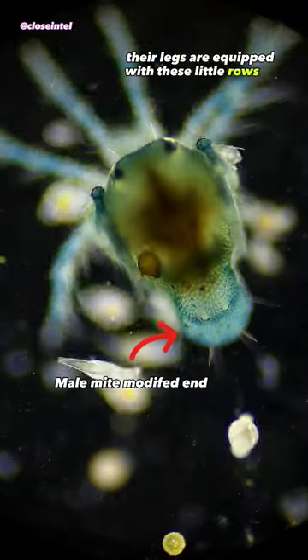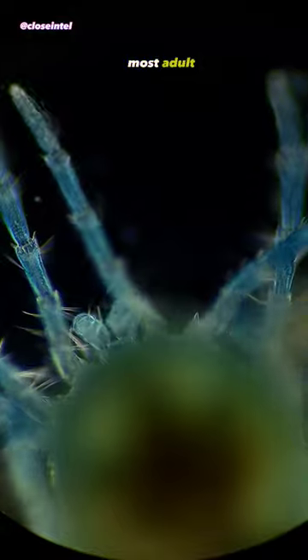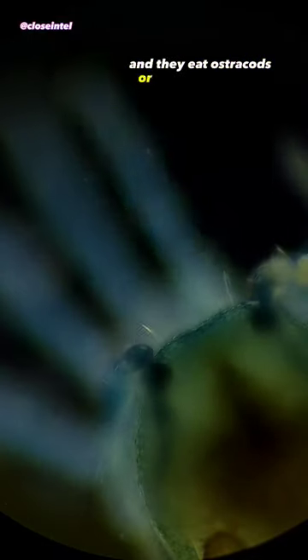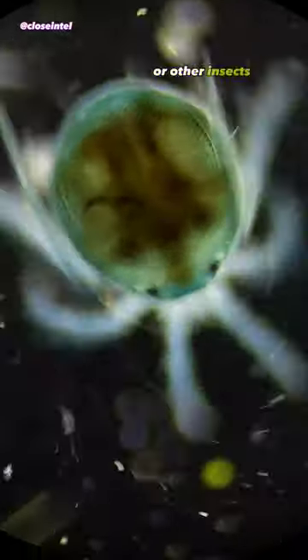Their legs are equipped with these little rows of hairs for swimming that help propel the organism through the water. Most adult water mites are predators and they eat ostracods or other crustaceans, while the larval stage are parasites to mosquitoes or other insects.